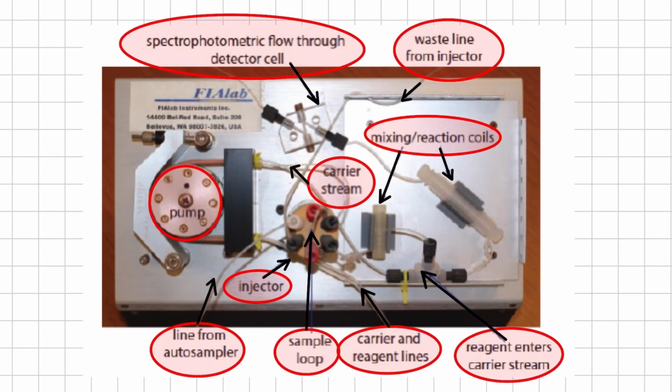The next important component of the flow injection analyzer system is the detector, which gives us the response to the analyte solution. The most commonly used detectors are electrochemical and optical detectors, as those used in HPLC. These detectors have also been designed around ion selective electrodes, and we can also attach an atomic absorption spectroscopy assembly. In this way we have a wide range of detectors that can be attached to a particular flow injection analyzer system.